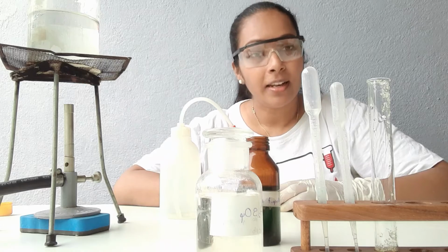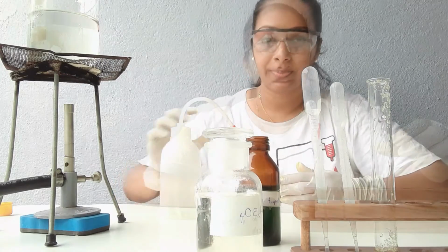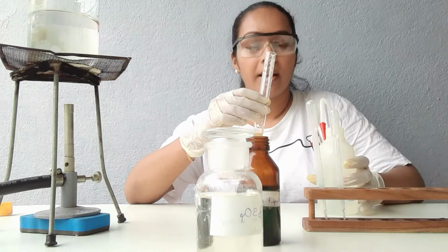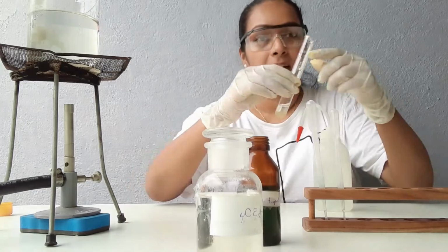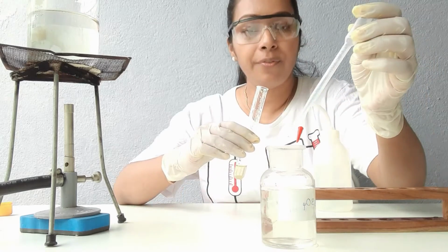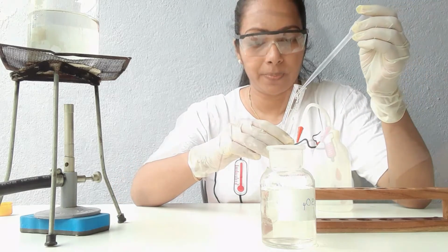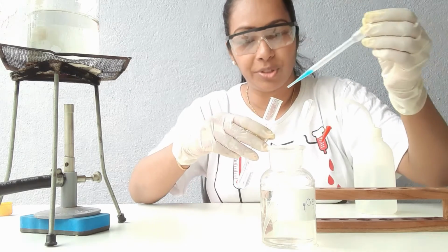Hi kids, let's do the practical to identify sucrose. I have taken a sample of sugar with me. I add a little bit of water into that and mix it thoroughly. And I add few drops of diluted sulfuric acid. Now I add few drops of Benedict solution.